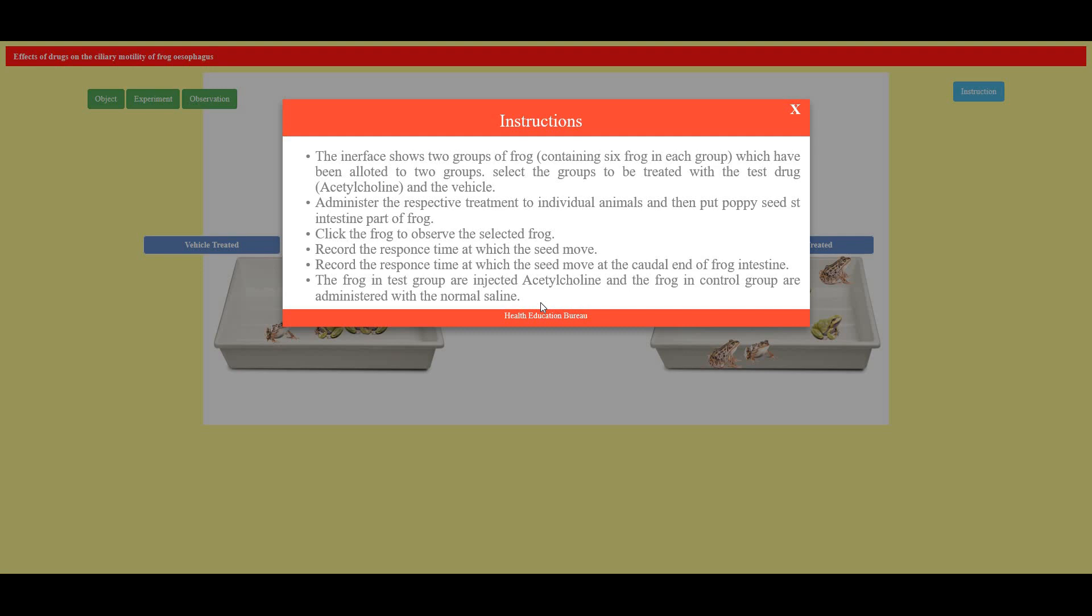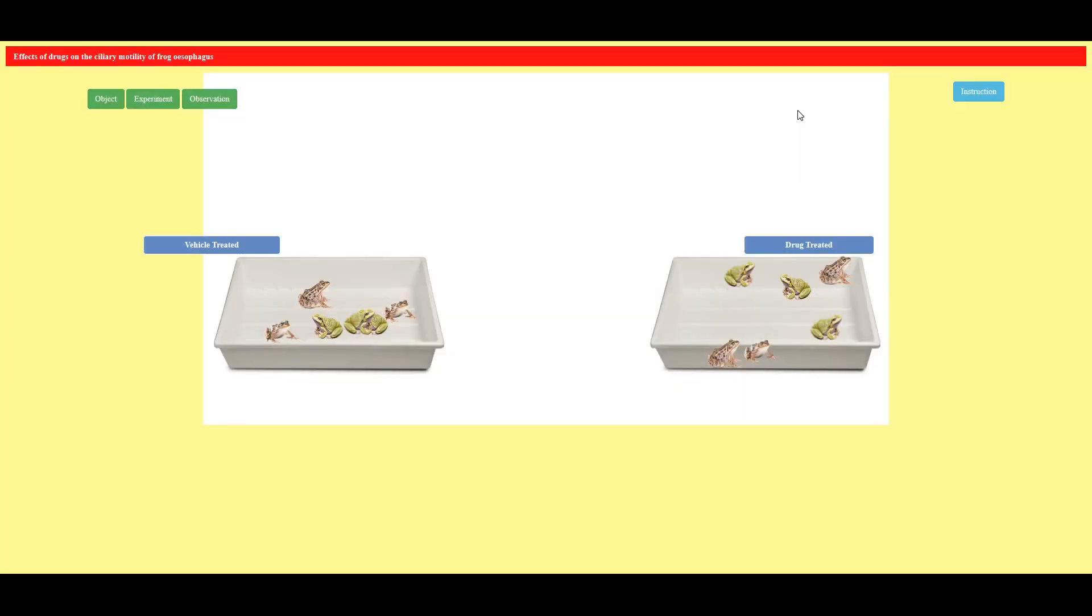Results to be obtained or observed, and next the movement of the poppy seed will determine the time taken by the acetylcholine and the saline.